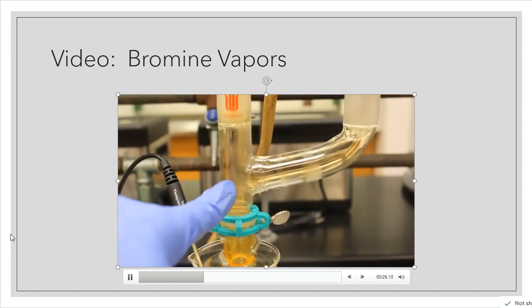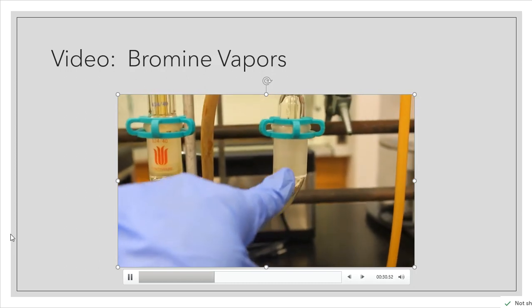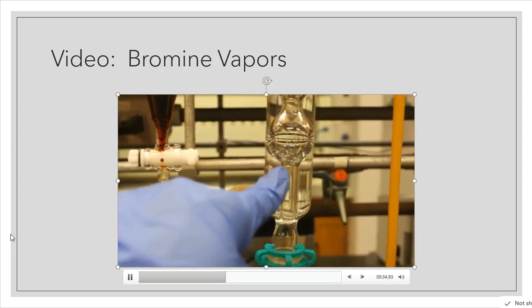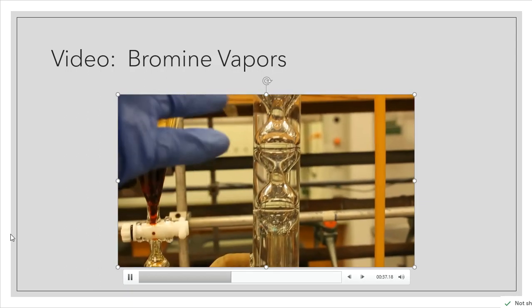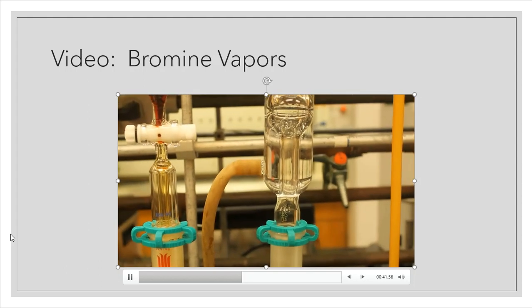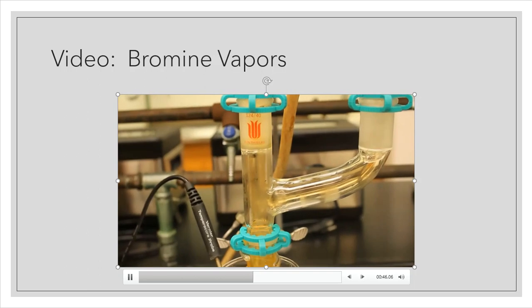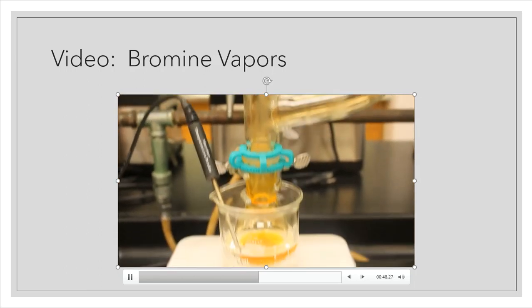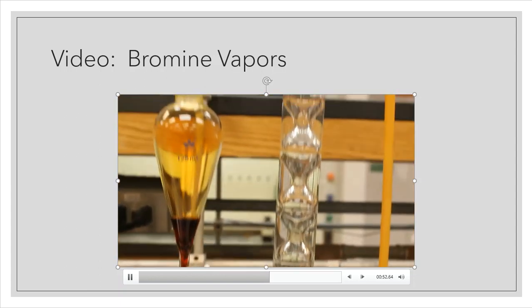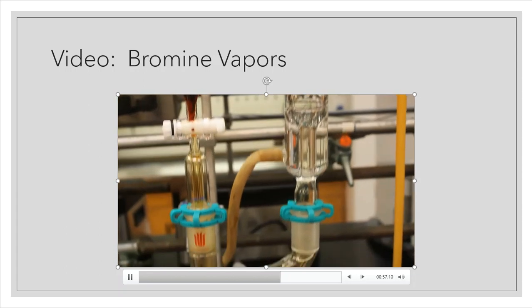If you track it, you can actually see those orange vapors begin to go through the Claisen and up into the reflux condenser area. But up in here, what do you see? Nothing, right? There's no orangey vapor at all. So that's a very good sign that my reflux is working the way it's supposed to. It's keeping my bromine in the solution, or at least as close to the solution as possible, and that way it doesn't escape and leave my reaction vessel. All right, so that's the purpose of the reflux condenser.